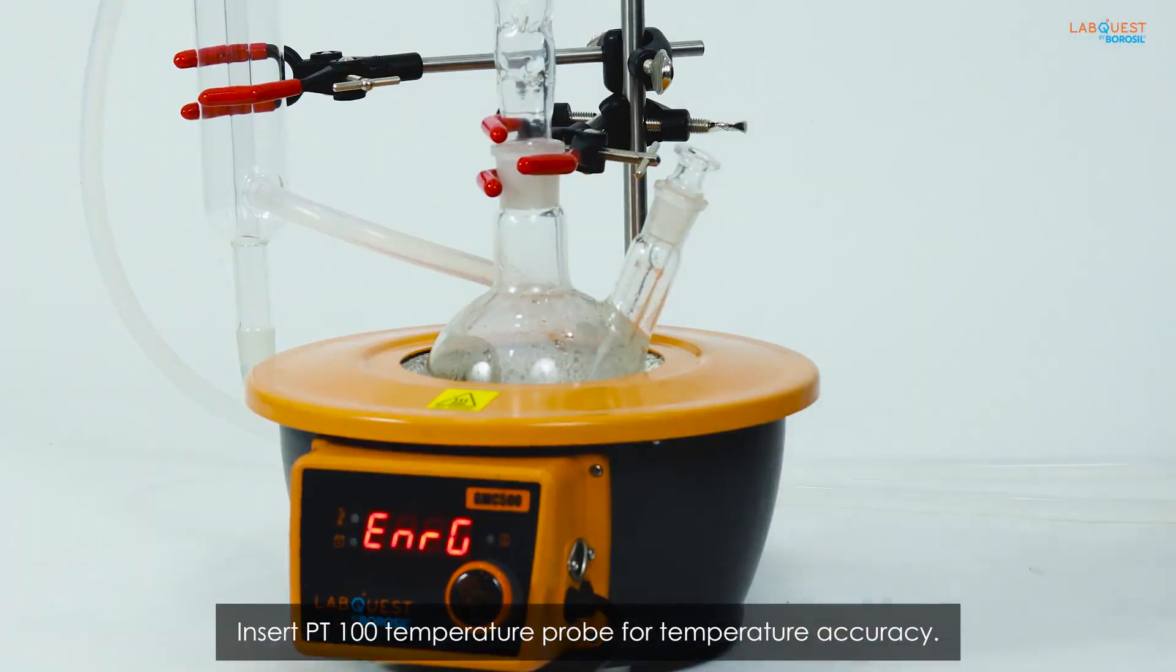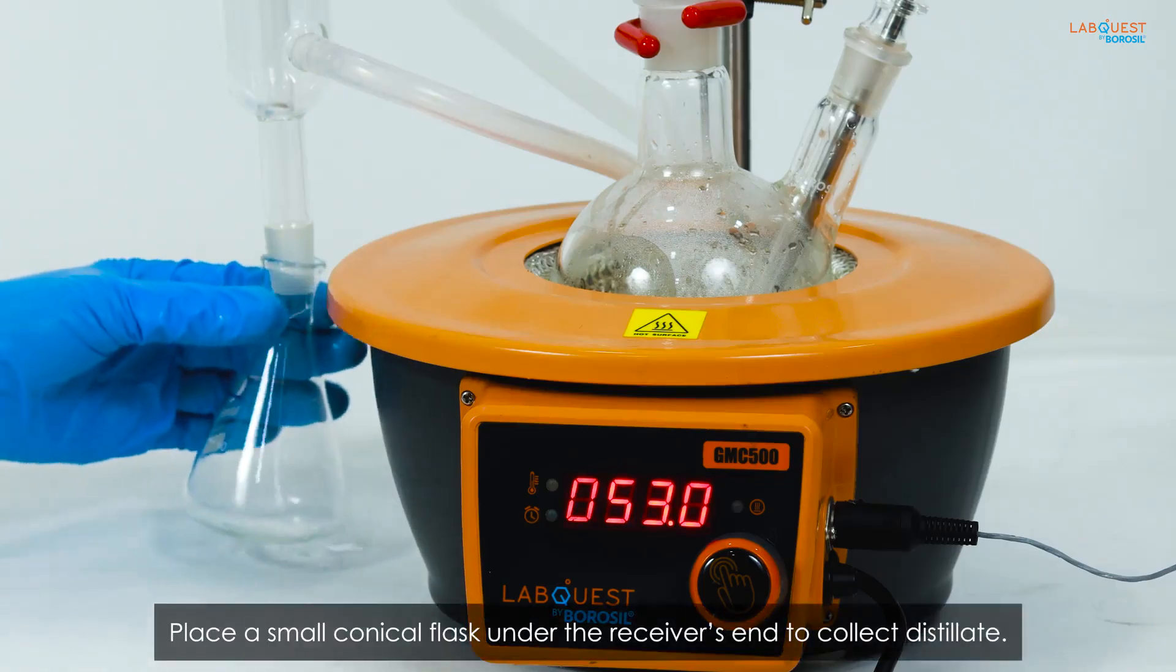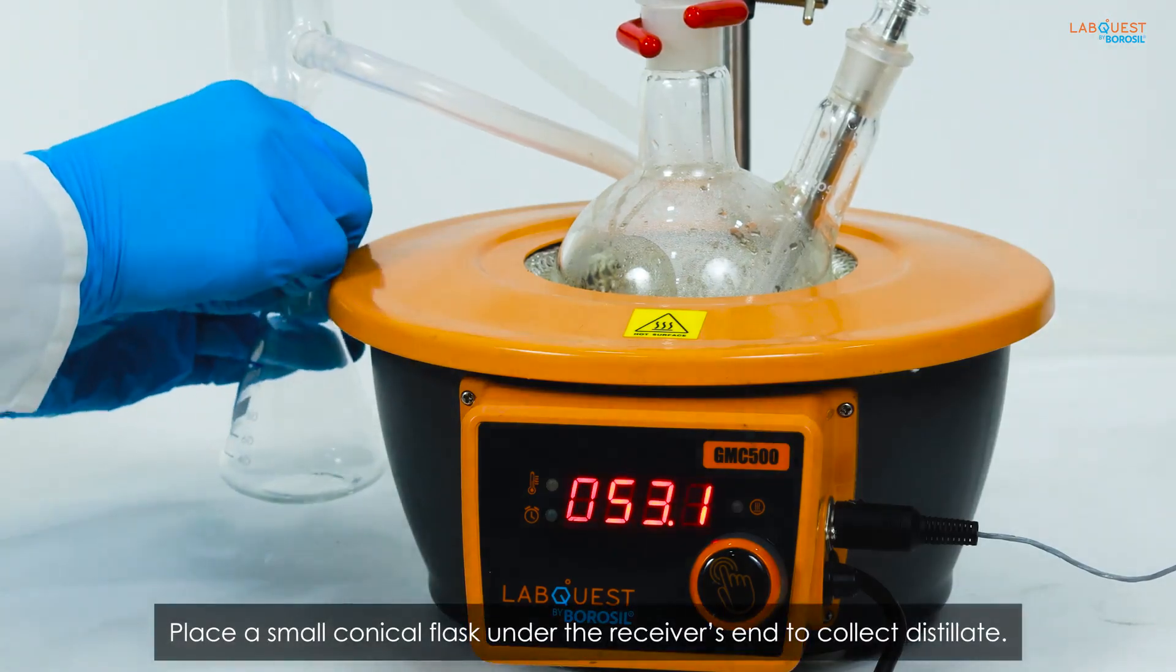Insert PT100 temperature probe for temperature accuracy. Place a small conical flask under the receiver's end to collect distillate.